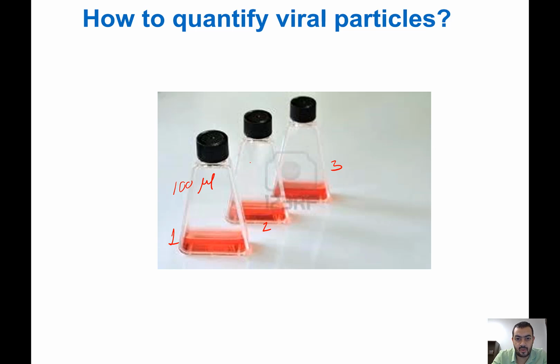In this one you have added 500 microliter, and in this one you have added 1000 microliter. Okay, so let's imagine that again you made the same mistake and you forgot to label the flasks.